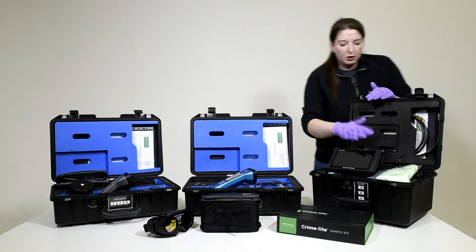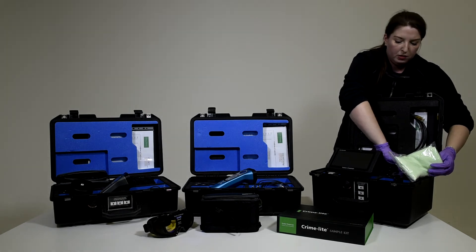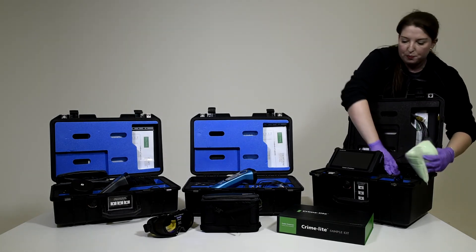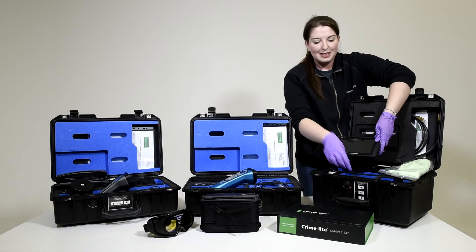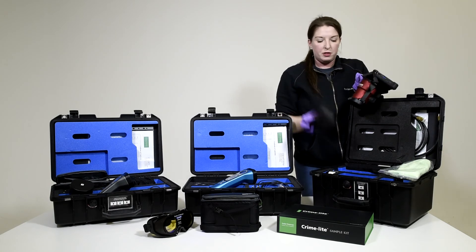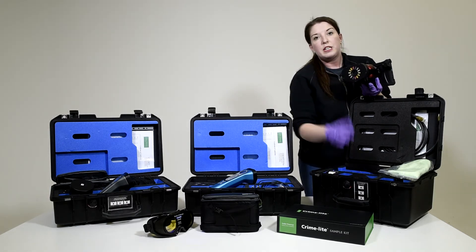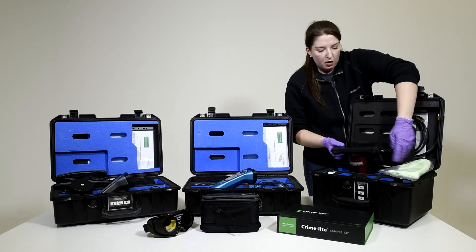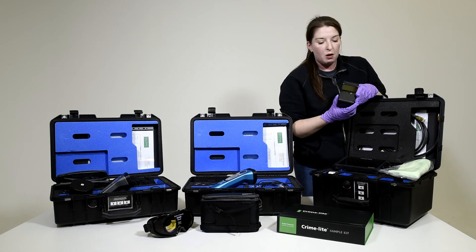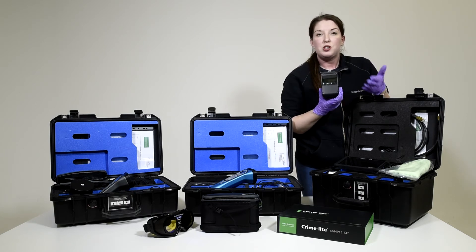Included in the kit, we give you a number of different batteries — two small 2-amp batteries and one larger 4-amp battery — which together give you up to 4 hours of charge on your Crimelight Auto. We've also integrated new accessories, including an oblique light source which fixes around the outside of the Crimelight Auto, allowing you to do oblique lighting for 3D finger marks such as finger marks in blood, or tool impressions. We also have our coaxial attachment, which allows you to take images on samples where the substrate may be shiny or reflective, making it difficult to otherwise image a finger mark.